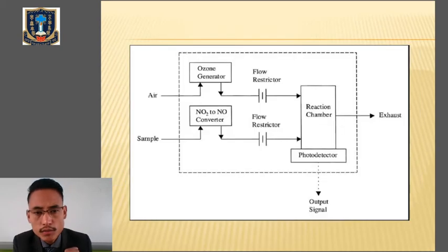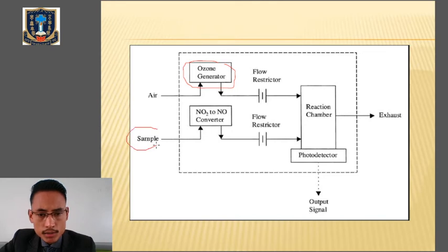So in the given figure, we have the ozone generator and the air sample.